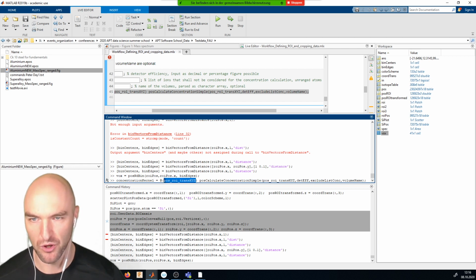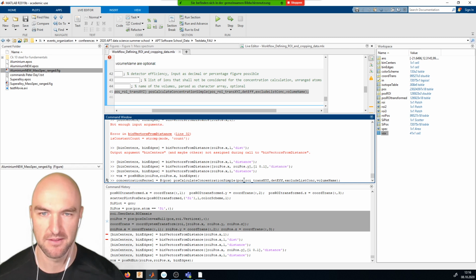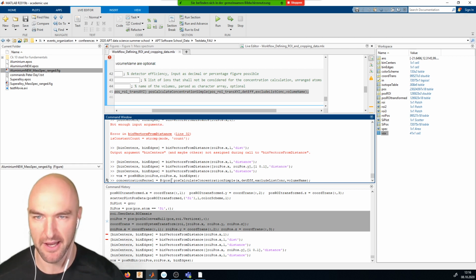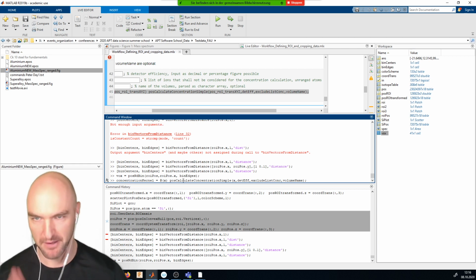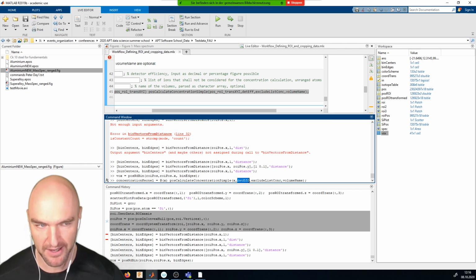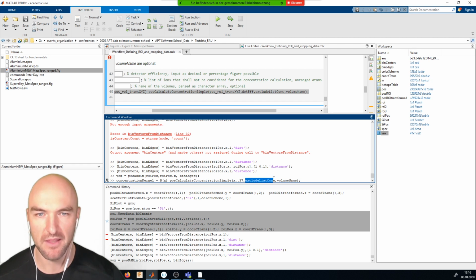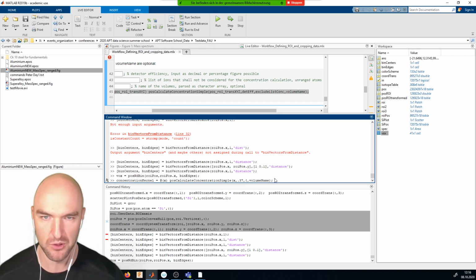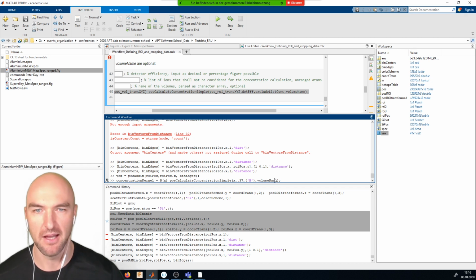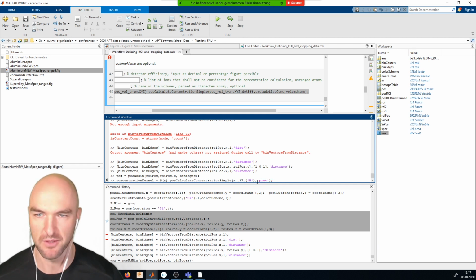And it works on a POS file. What we call that actually doesn't matter. Maybe I'll just call it X, or I just call it Dave, or whatever. It's just for the definition of the concentration kernel. Then we need all of the information that is static, that has nothing to do with the POS file itself. That is detector efficiency, which is roughly 0.37 for our atom probe. Then the exclude list of elements that we want to exclude in the calculation, which in this case is only going to be hydrogen. And then a volume name, and that is going to be maybe precipitate or whatever.